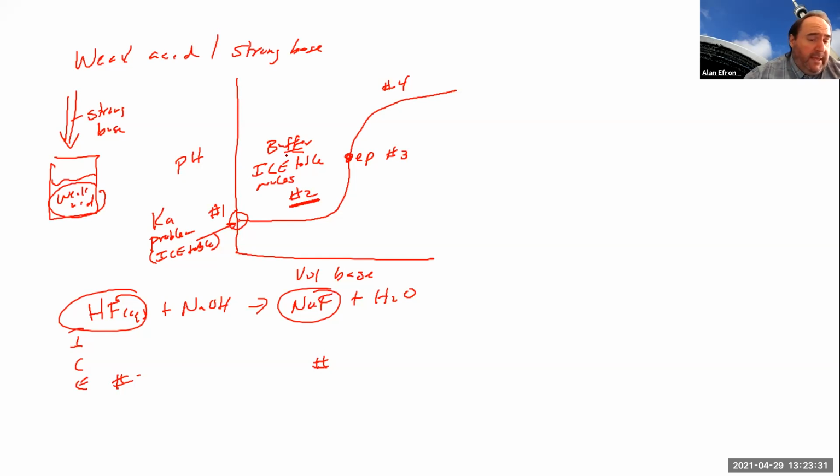Also different when we get to the equivalence point, although it is still the moles of acid equals the moles of base.